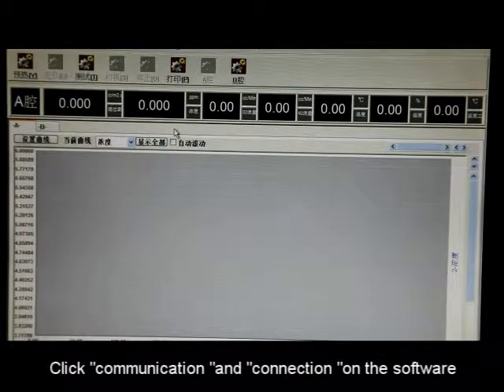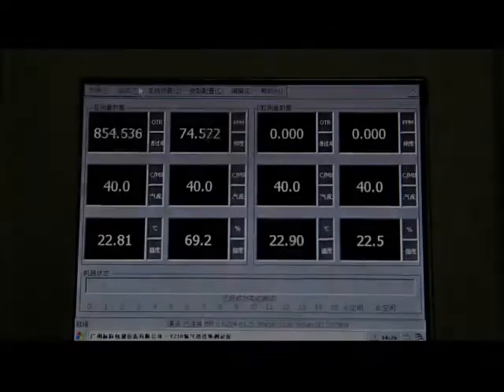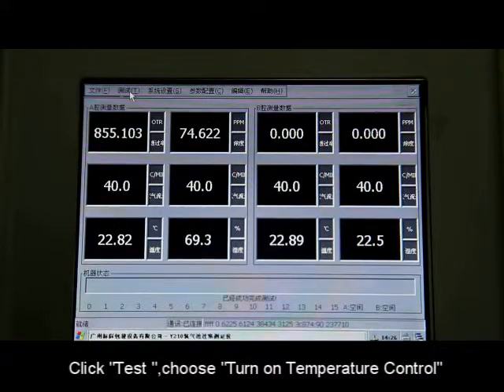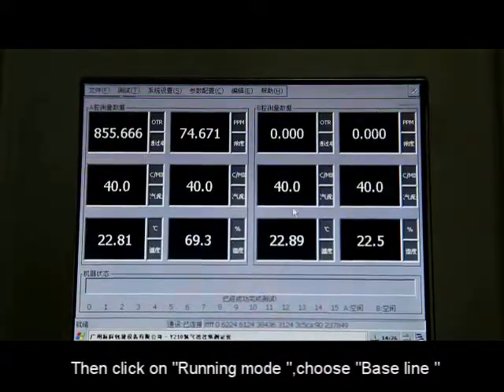Click Communication and Connection on the software. Click Test, then choose Turn On Temperature Control. Click on Running Mode and choose Baseline.